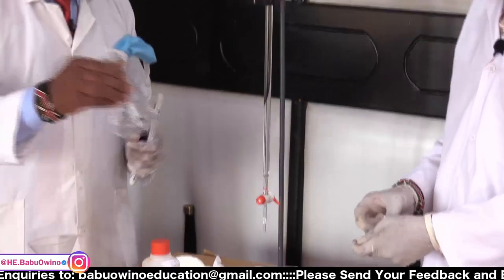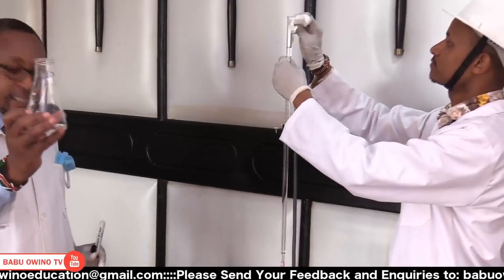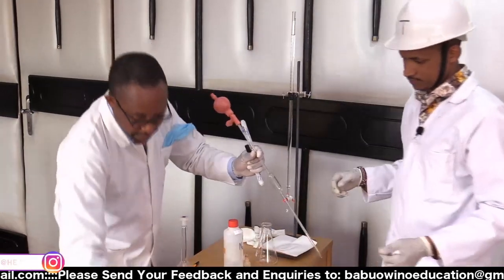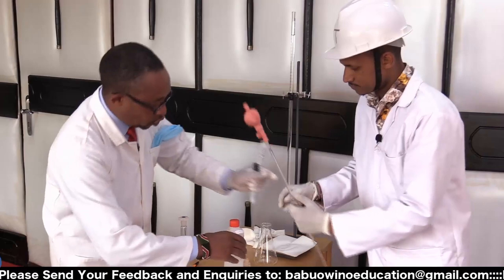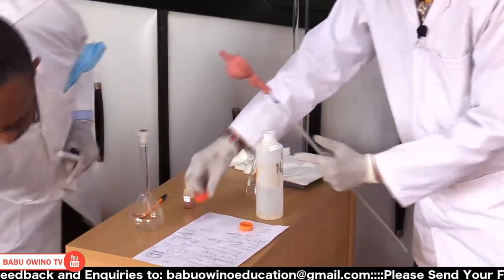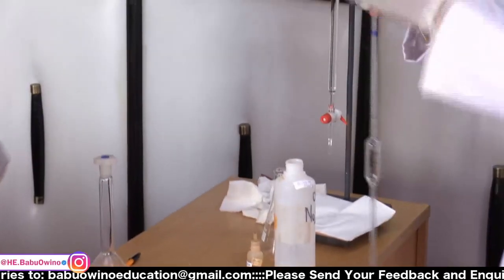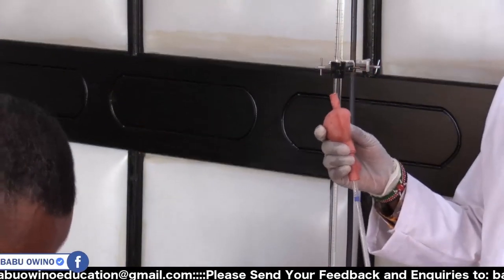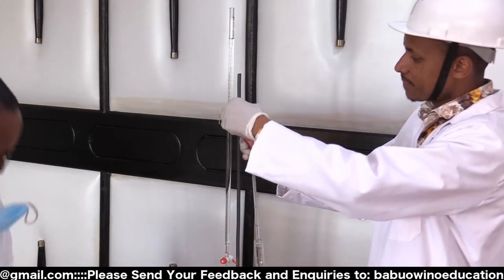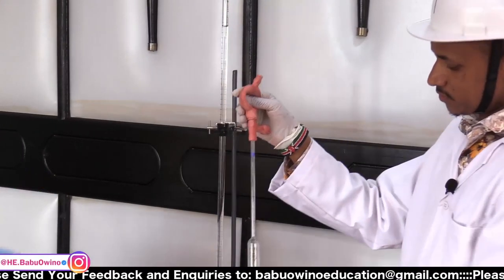Yes, then from there, you ensure that your conical flask has nothing. Then Mheshimiwa will pipette the base, that is sodium carbonate. You open the sodium carbonate. And then the indicator is methyl orange. So what we did first is to clean all our apparatus with distilled water. Then after that, just press here on the pipette to release the air, remove the airlock.